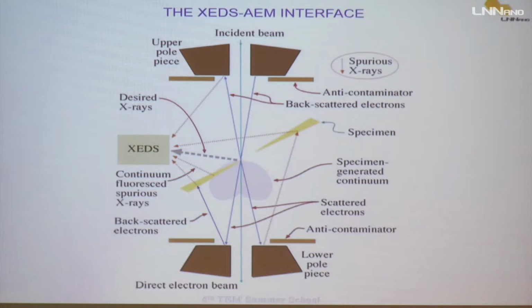Well, here I show the interface between the EDX spectrometer and the TEM, okay? You can see here the specimen, a specimen with a hole inside it.